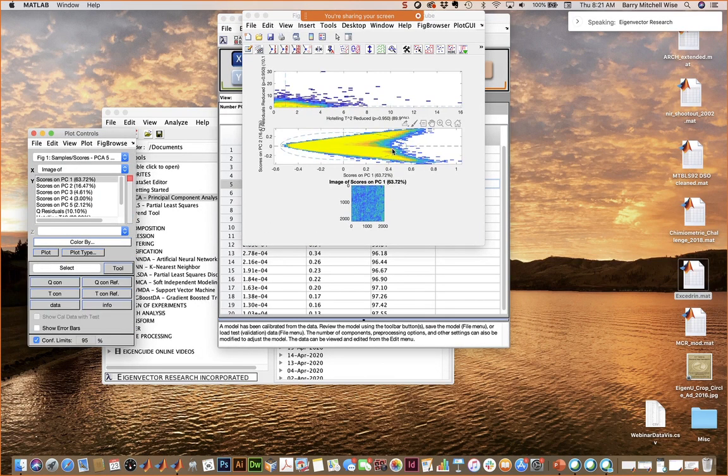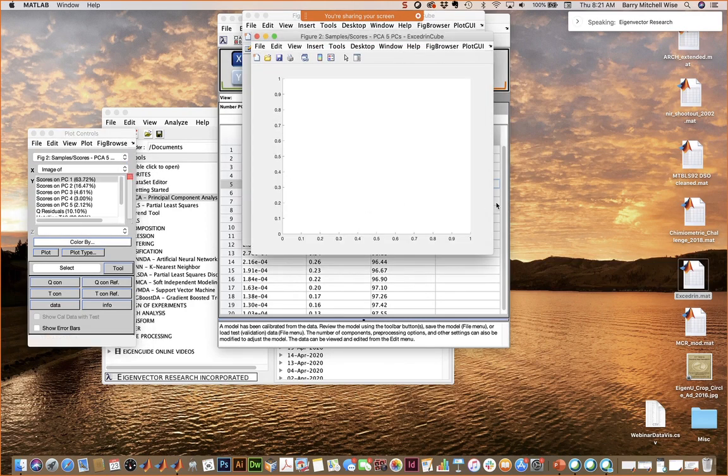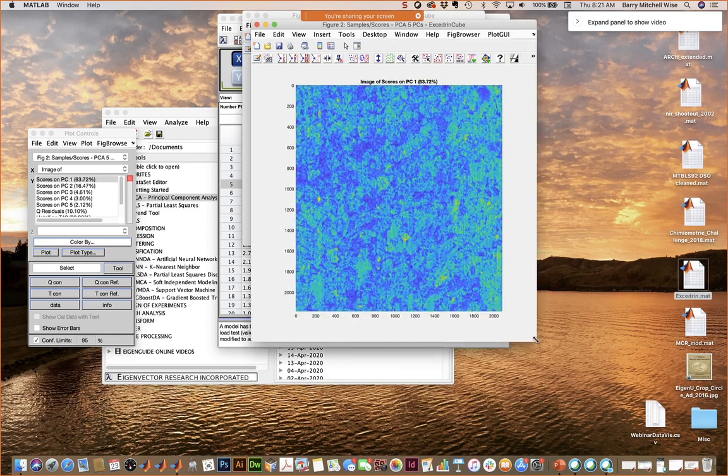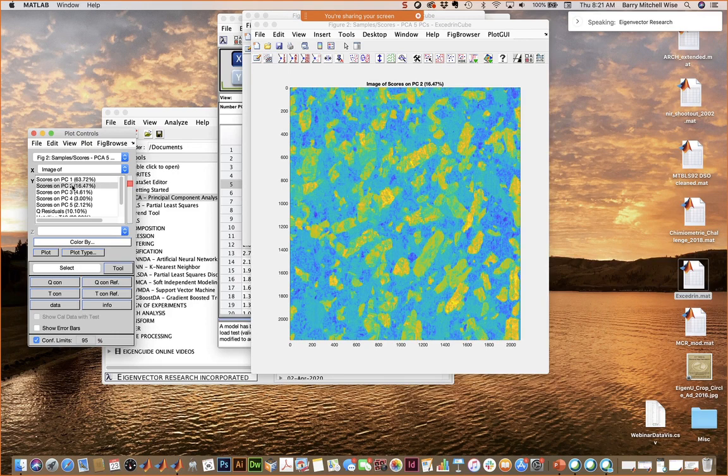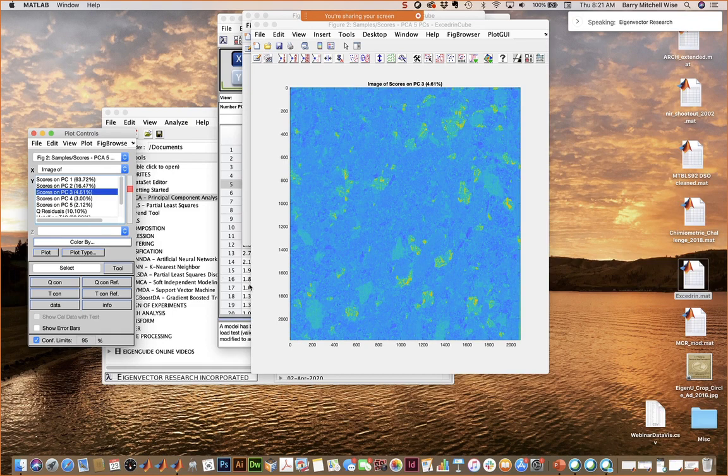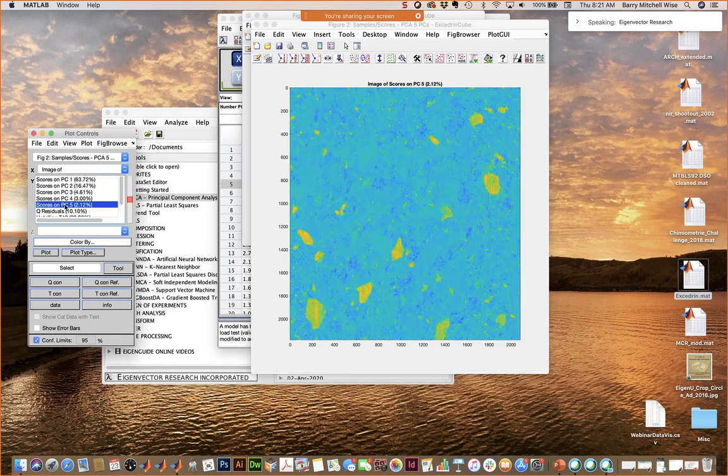And here now we can see the tablet. We're looking at the cross section of it and the scores on each component. And so image PCA is really nice for summarizing information. But it turns out that in some of these, we can really see the domains of each thing that's in here pretty well. These right here are actually the aspirin, and these here are the caffeine, and they really come out in this component.